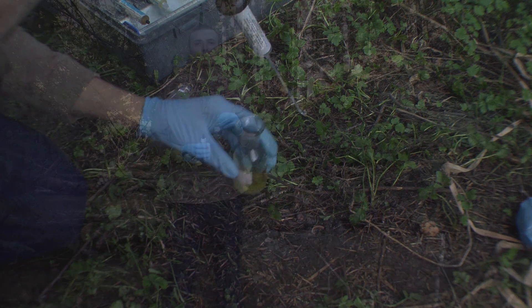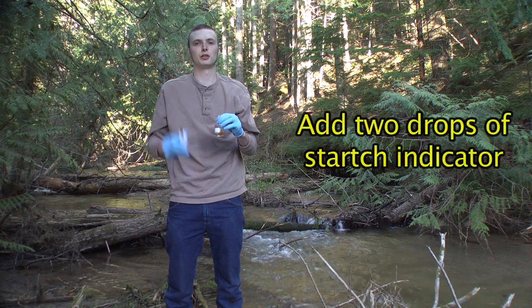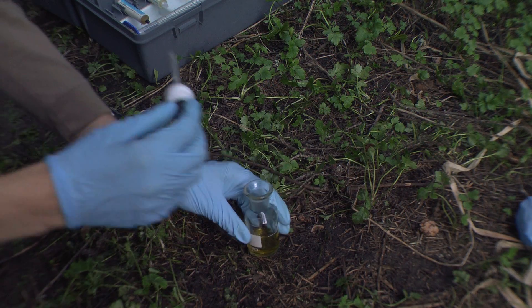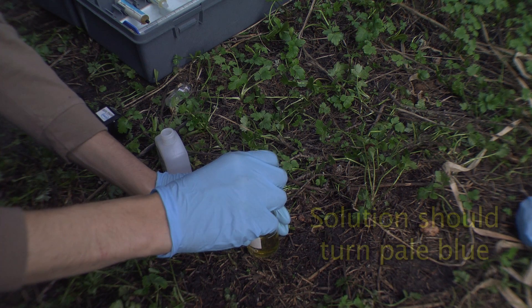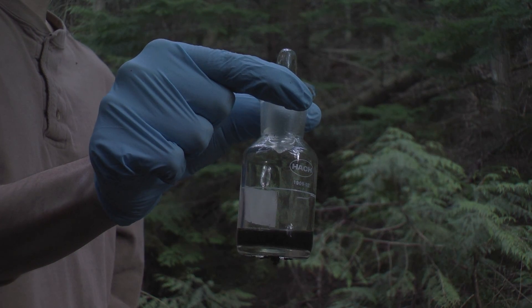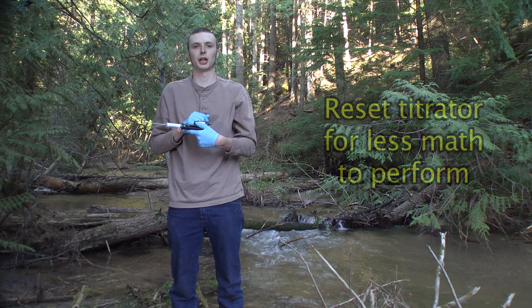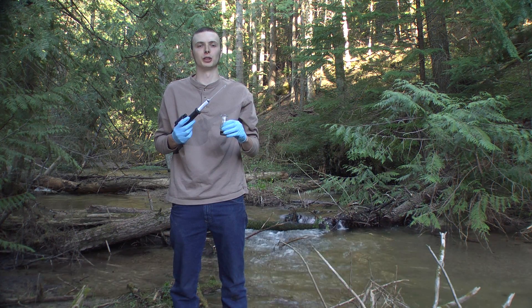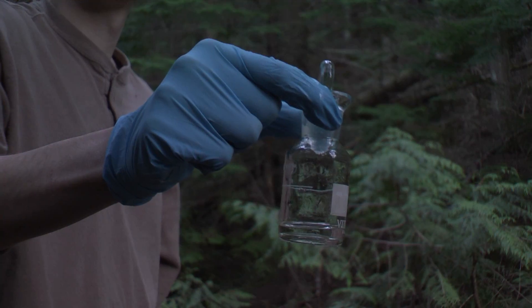Once your sample has turned to a pale yellow, you will want to add two drops of starch indicator to it. Your solution is going to turn to a pale blue-ish color. A nice trick is to reset your digital titrator at this point so that at the end you have less math to do. Keep adding the digital titration solution until your sample turns clear.